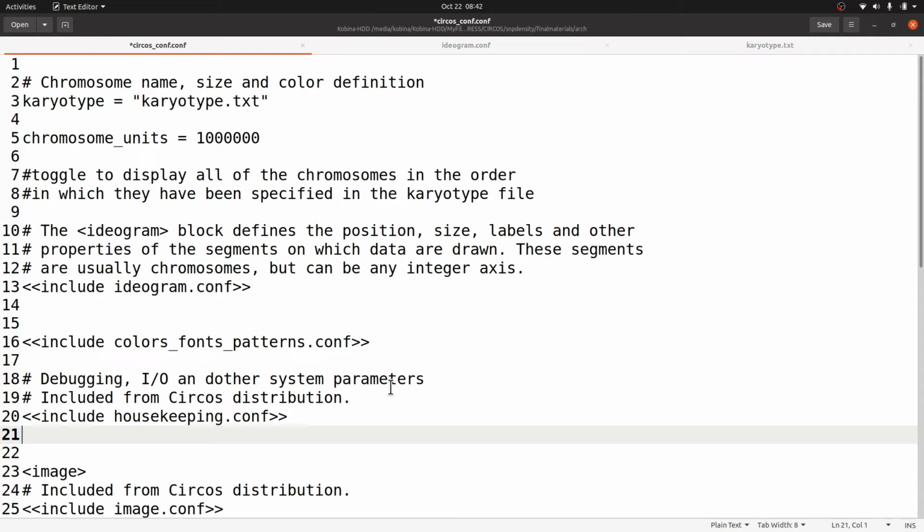I'm going to go through the code line by line with you. I'm going to do this in an interactive session and explain what each of these lines does. I'm doing this because beginners will need to understand how Circos works with respect to the commands that you use. So that's what we are going to do. Now let's continue.